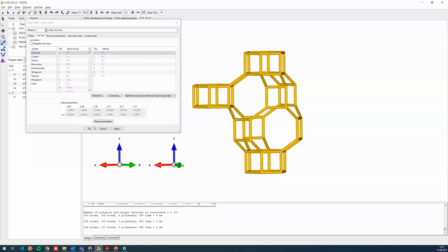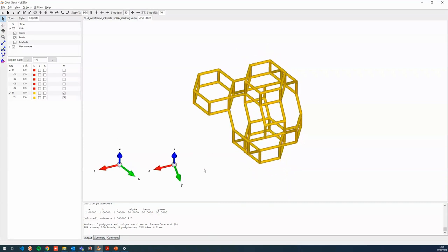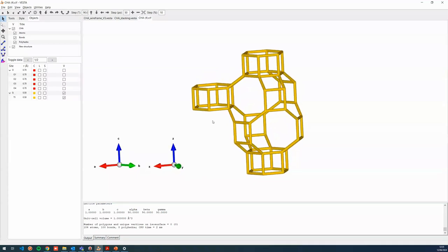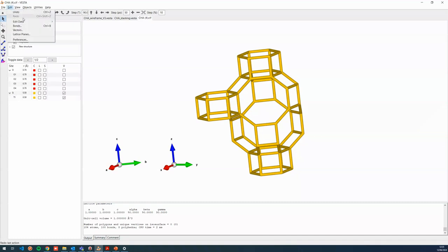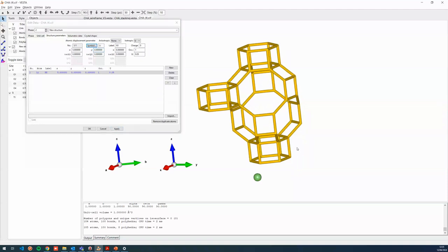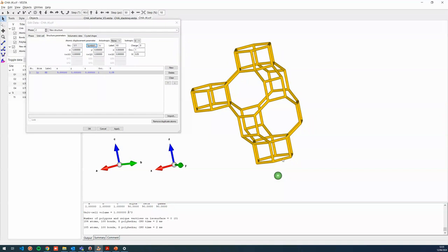Let me show it a bit better. Over here you can see it's just a normal three-dimensional axis rather than following the symmetry of this. And this makes it a lot easier to add molecules, because if we now go to structure and go to the phase tool, which is our new structure we created, we can add an atom. Let's add lithium, for example, and we can position it somewhere random. There you go. You can see it's at the bottom.